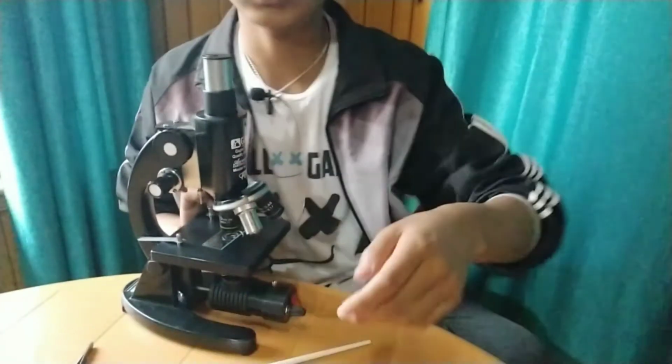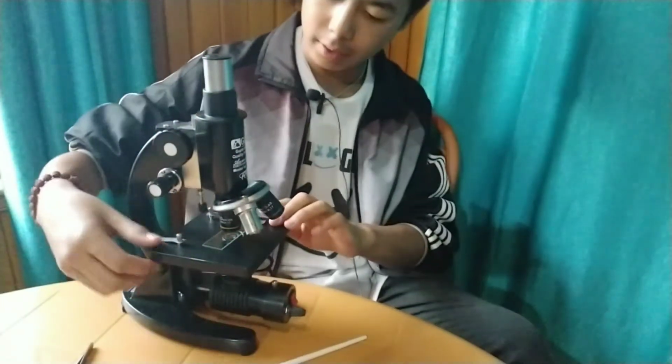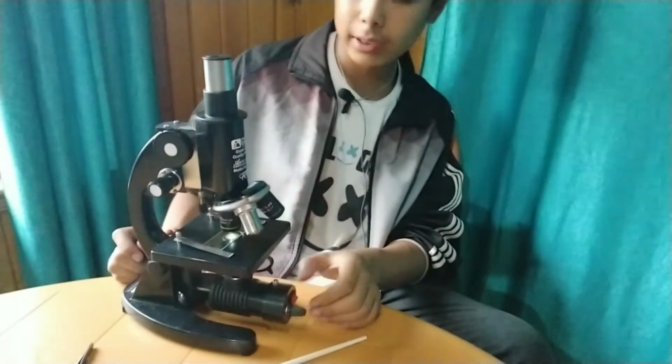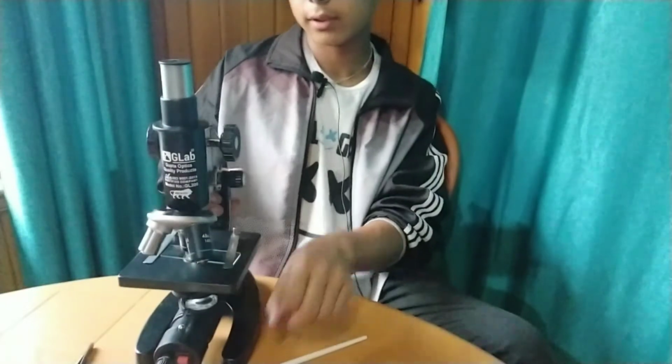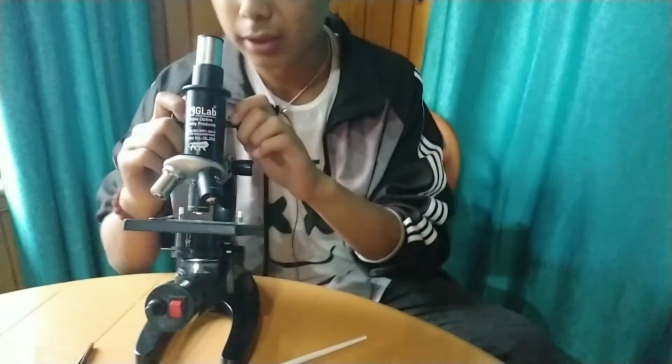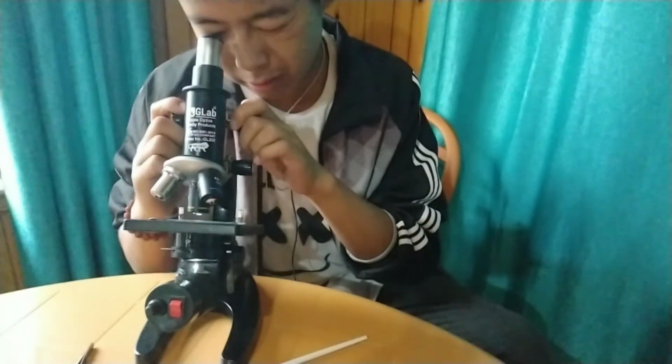So we have a microscope. I'm going to place it on the microscope, and let's turn on the light and let's observe it under the microscope.